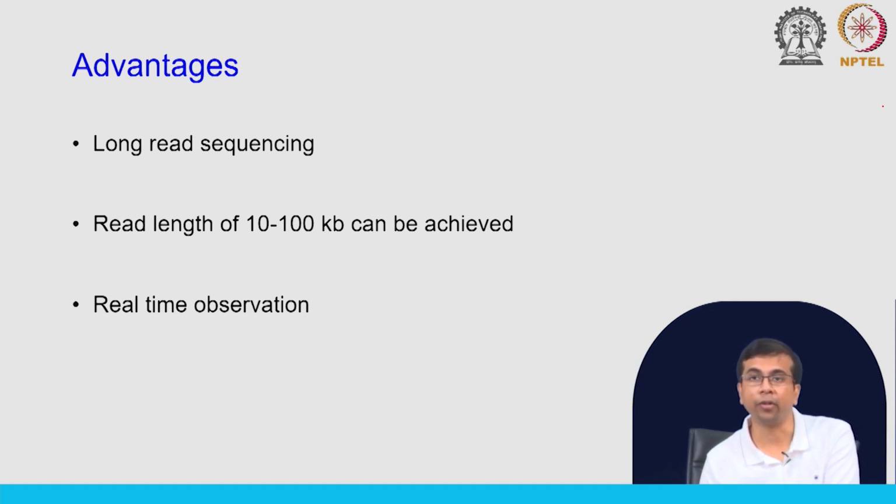In addition, this is also a single molecule sequencing, right. So, we are getting the signal from a single molecule. Like SMRT, we are sequencing one molecule, and each nanopore will get a unique DNA molecule. So, this is again really advantageous, because we can now identify the changes in the DNA molecule just beyond the bases. Okay. What if there are some other modifications or specific characteristics? Those can be identified because we are now observing these single molecules in real time.